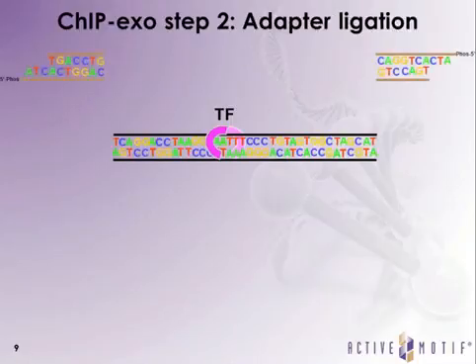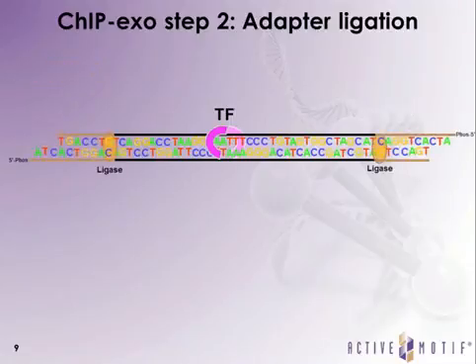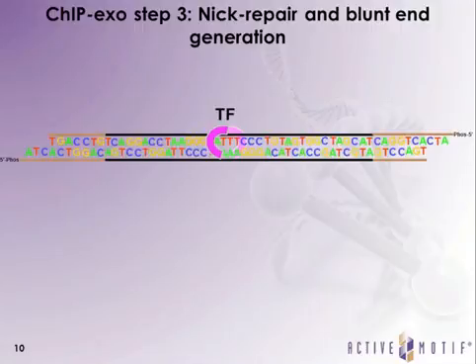In ChIP-Exo, this is where you add your first adapter set, and these adapters are special and unique to ChIP-Exo in that on the 5' end of these adapters, you have a phospho group on both sets of adapters, and this is very important for the initiation of exonuclease activity by lambda exonuclease, which requires a phospho group to be on the 5' end. So we can add these adapters much the same way as you would add your adapters in ChIP-Seq, using T4 ligase to, in this case, blunt-end ligate to our transcription factor-containing DNA fragment. And now we have our adapters ligated.